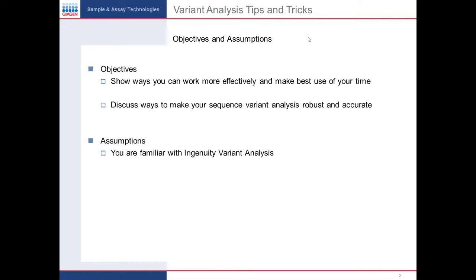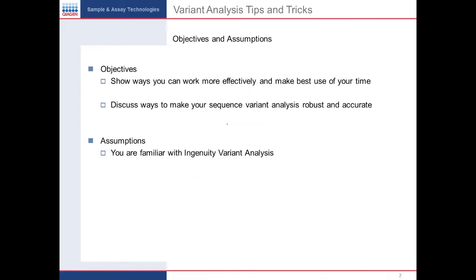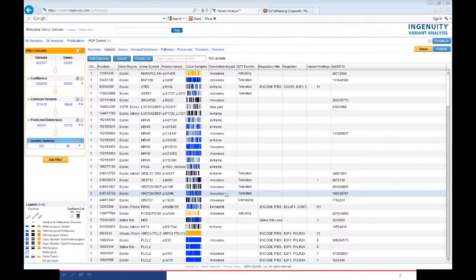And then lastly, one of my assumptions is that everybody who's on the phone today is at least relatively familiar with Ingenuity Variant Analysis. Meaning you've seen the application, and you're familiar with the display, the filter cascade, and the general concepts of how it works. So I'm not going to spend a lot of time talking about the basics. We have lots of other videos that will do that. Today is really working on the assumption that you are familiar with the application.